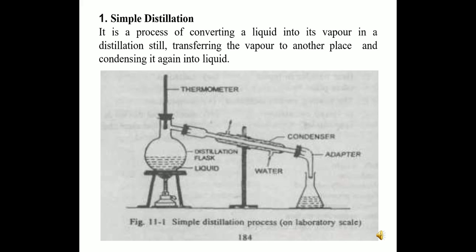Firstly, let us talk about simple distillation. It is the process of converting a liquid into its vapor in a distillation still, transferring the vapor to another place and condensing it again into liquid. The figure given below shows a simple distillation process on laboratory scale.